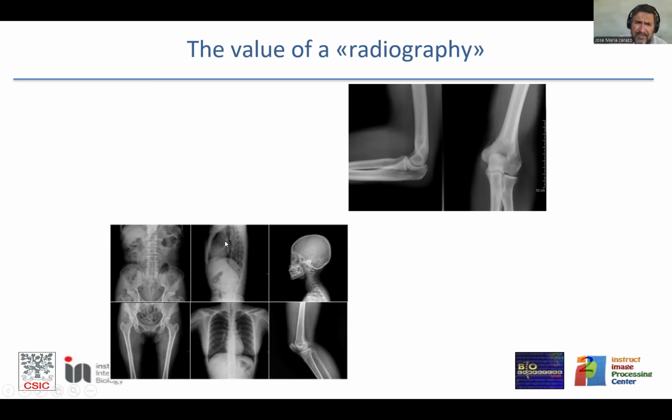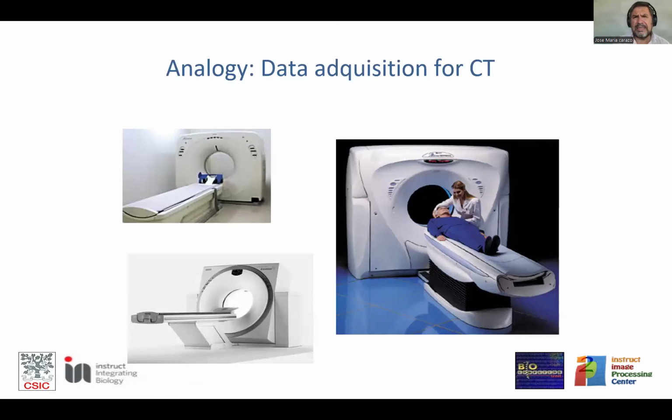It is really very difficult to understand this image, unless in the case of radiology, you have a lot of prior information that is the anatomy of the human being. But you are having now a macromolecule, and you don't know anything, and then it is very difficult to understand these projection images. And the way to get around that problem is that we are having information of a two-dimensional nature when we have a specimen that is of a three-dimensional nature, and we are never happy with that.